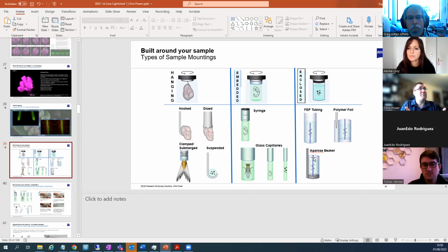So imagine a jelly mold. So you make a mold, pour agarose in, put a hole, and that's how they contain things. And then by accident, they discovered that FEP, this plastic used in flow cytometry tubes, has a refractive index so close to water that you can image through it. It's a lucky coincidence.